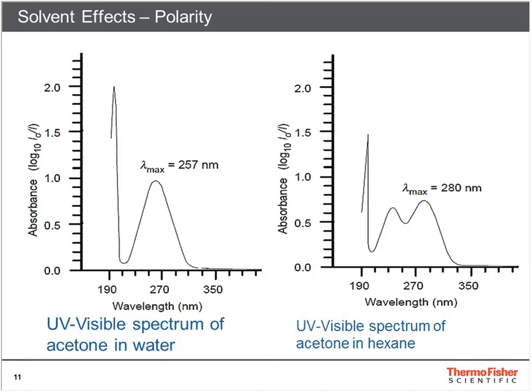The reverse is also possible if the excited state reduces the degree of hydrogen bonding. Here the transition is n to pi, and the shift of wavelength is due to the reduction of solvent hydrogen bonding. To make it even more complicated, the molar absorption constant also changes from solvent to solvent.